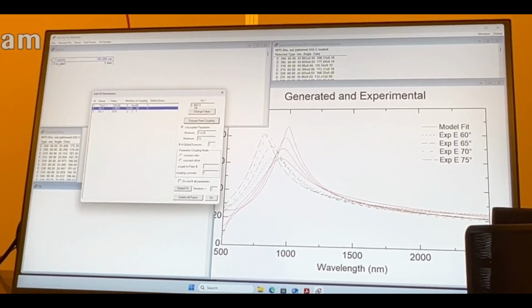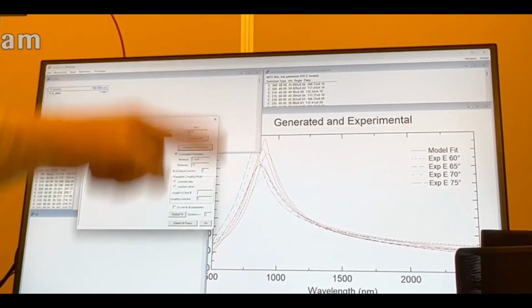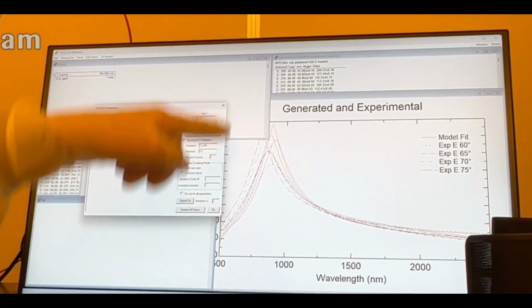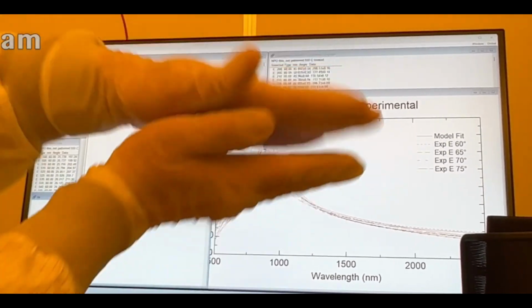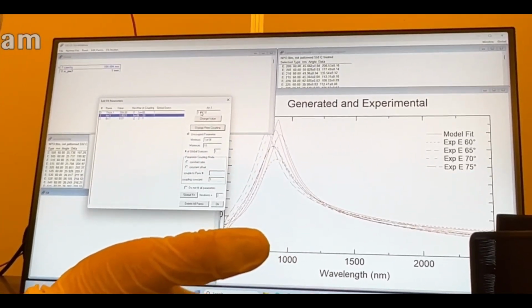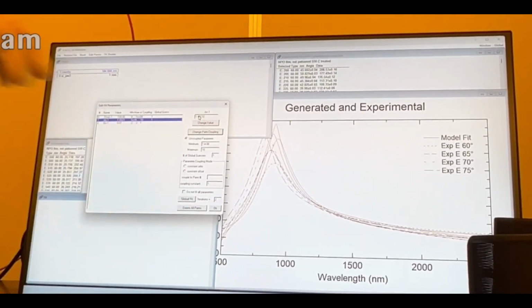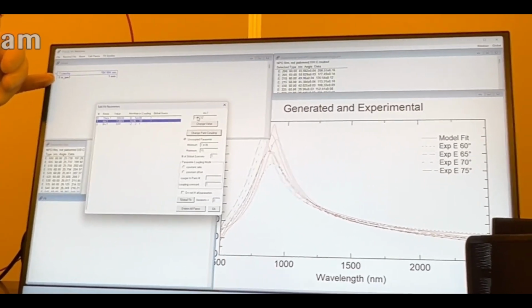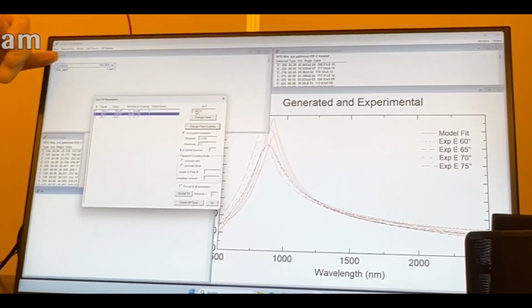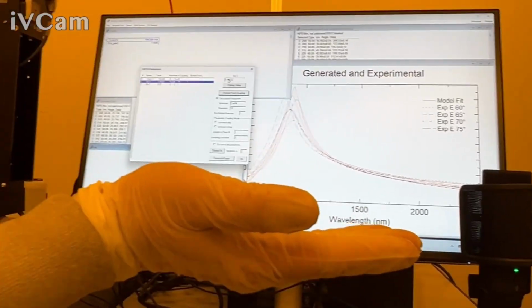So you can see essentially when you have a transparent film on say silicon and it's thick enough to develop interference oscillations, psi is nice to look at because the peak to peak height in psi is really hyper dependent on the index contrast between the film and the substrate. So if my silicon I showed had a refractive index around 3.5 to 4, the film currently has a refractive index around 1.45, 1.5. So very, very different refractive index. So that would be big peaks in psi.